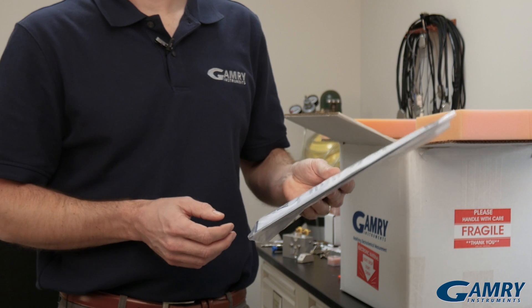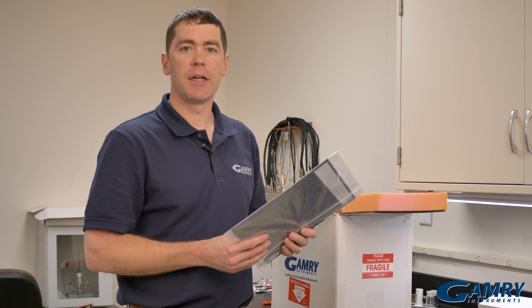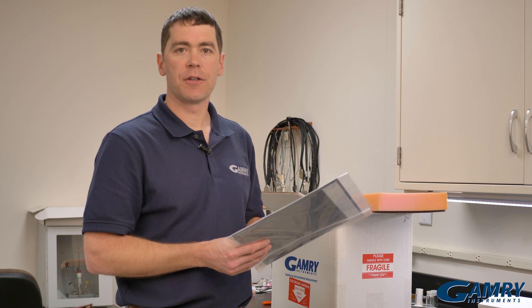Then we come across a bag of literature. Our CDs are in here, our quick start guide, a mouse pad, and a piece of literature about our manuals. All our manuals are now contained on the CD, or they're available on our website, or through our mobile app.